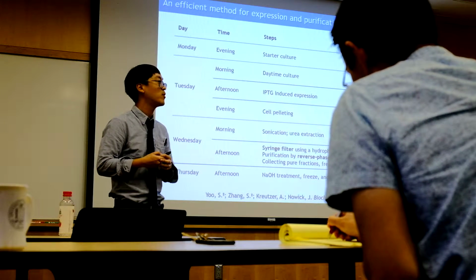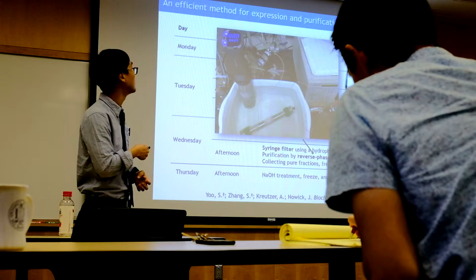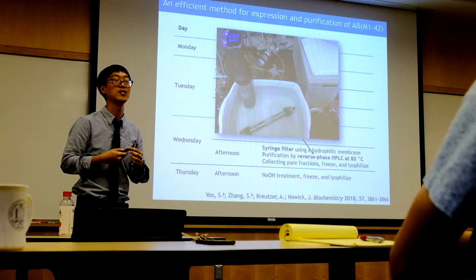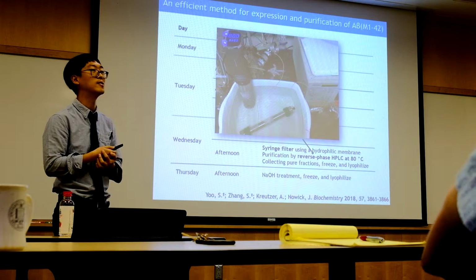And I think also the people in here know how I heat the column here. It's a sous vide machine from my kitchen. Yeah, it's working pretty nicely here.